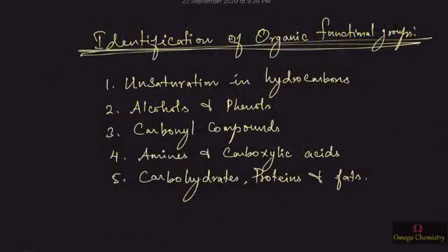Hi students, in this session we are going to learn about the tests that are useful in detection of the organic compounds and functional groups, right? Since all functional groups cannot be discussed in a single video, this is going to be a series of 5 videos, and in the first video we are going to learn about the tests to identify the unsaturation in hydrocarbons.